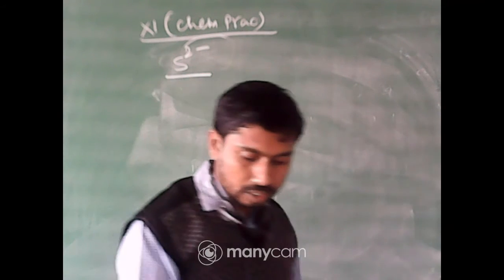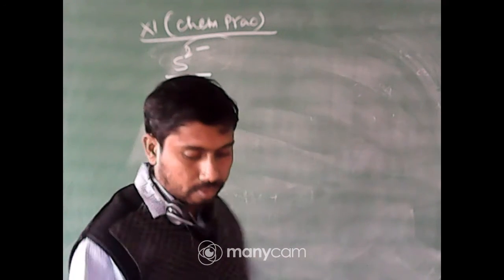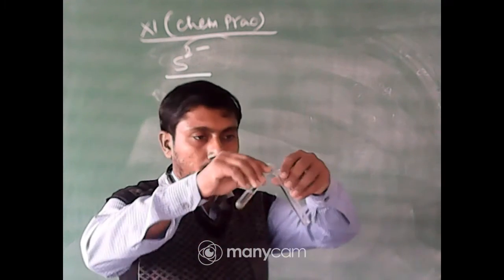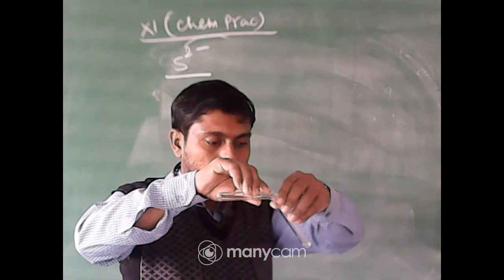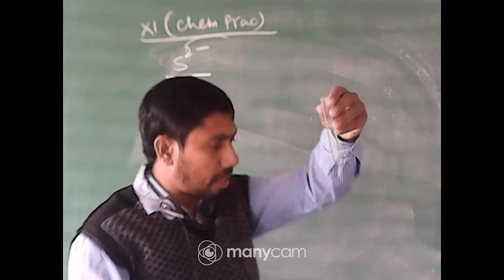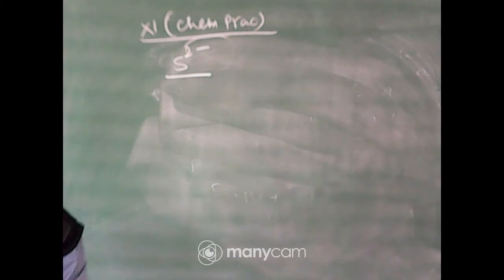I am keeping it here in the test tube stand. Now taking this sample, the OS, original solution, a very little amount, only 2 to 3 ml is sufficient.